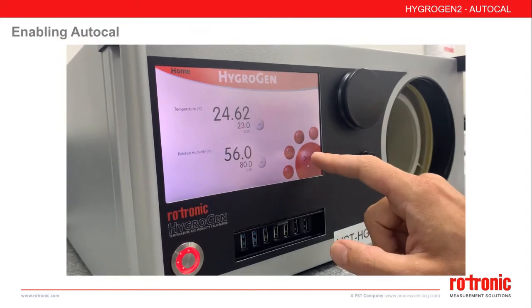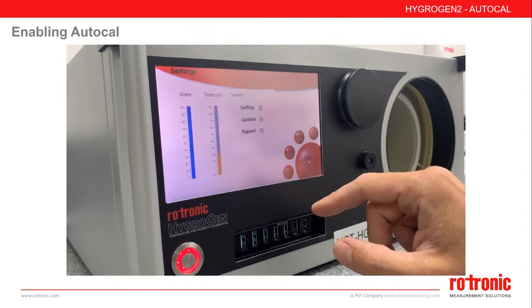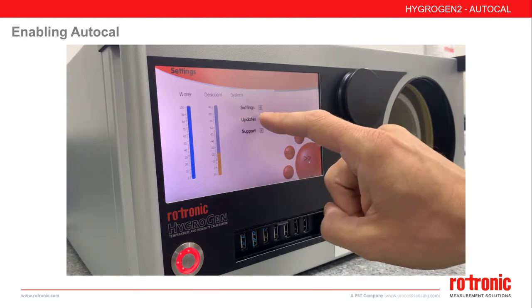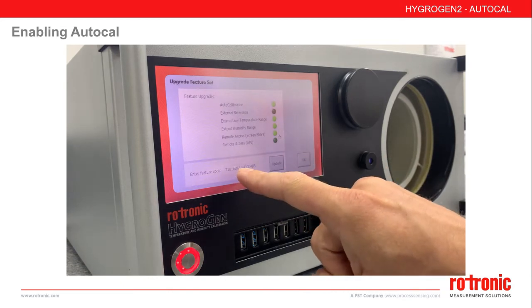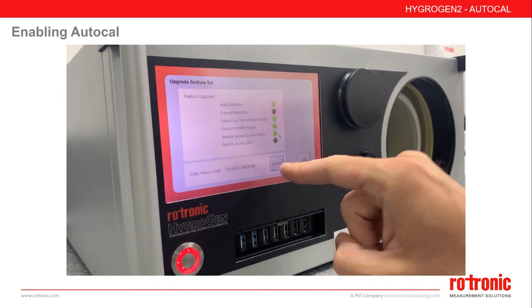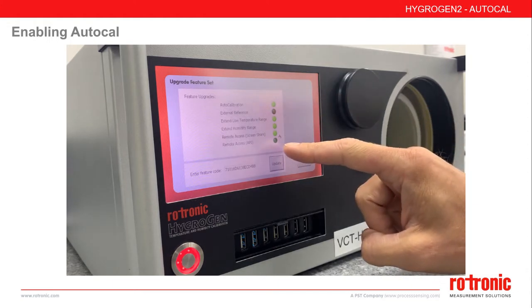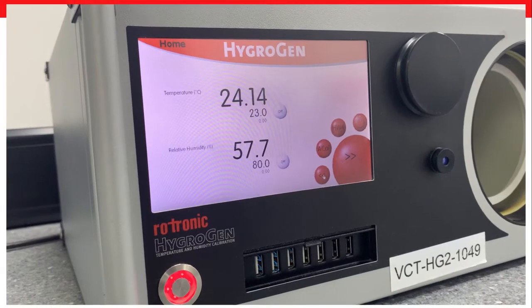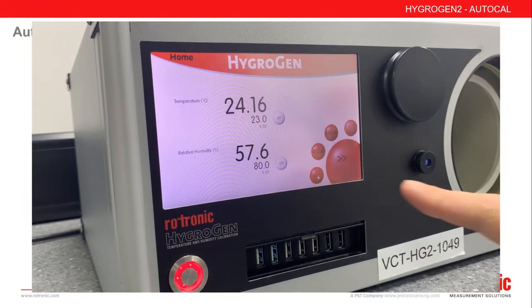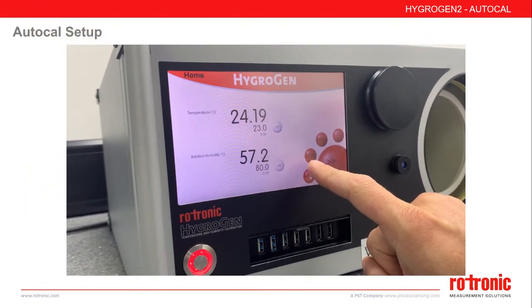To enable the AutoCal features, scroll to the settings screen, select Updates, Upgrade Features, and enter your feature code here. Press Update. Once applied, you will see all active features on the screen above. With AutoCal enabled, we will now see the ACAL button on the main menu.